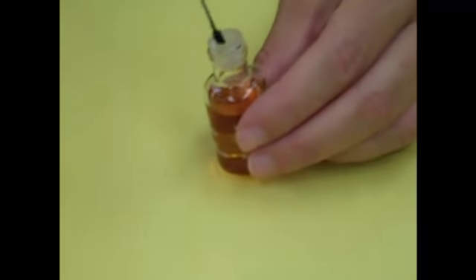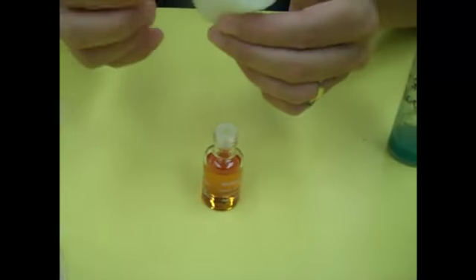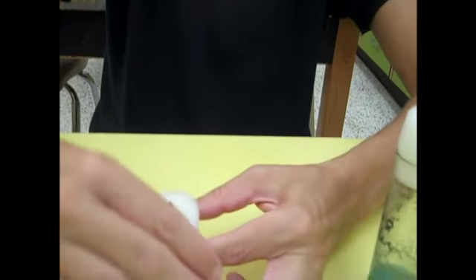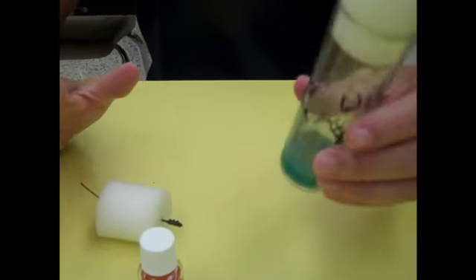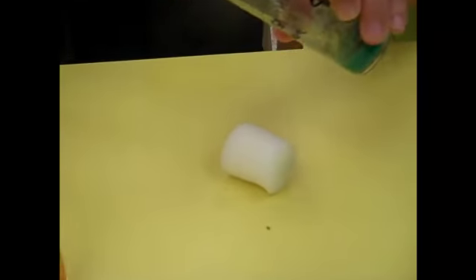What you do is you put the little wand, dip it in the fly nap, and what I would do is pull it up like this so it's not hanging down. Now, this is where you have to be a little bit skilled. You need to tap the flies down, and you've got to be quick. Tap them down, and then whoop, and see, I had a few escape on me.